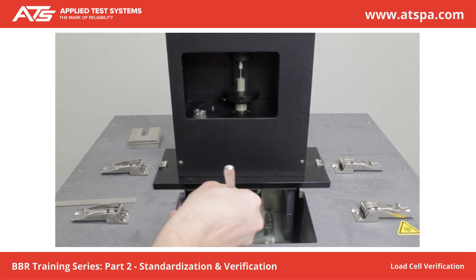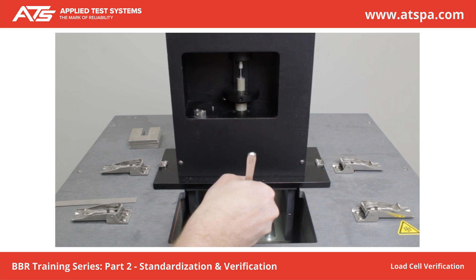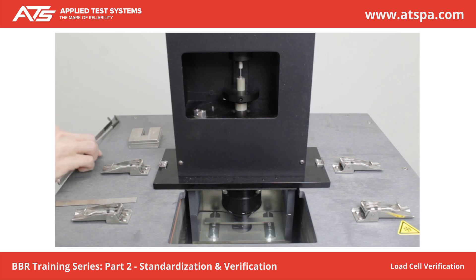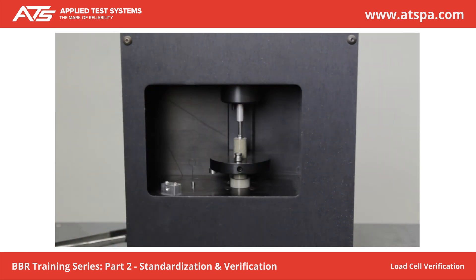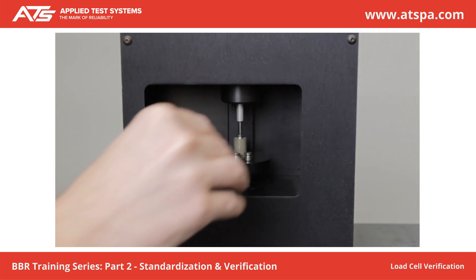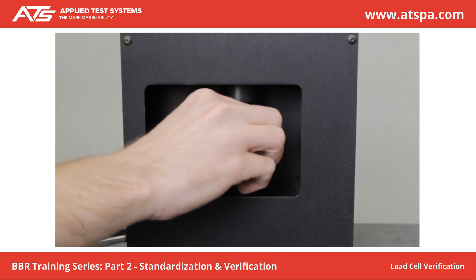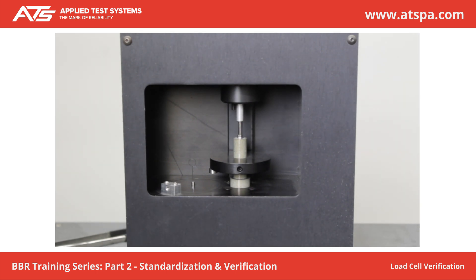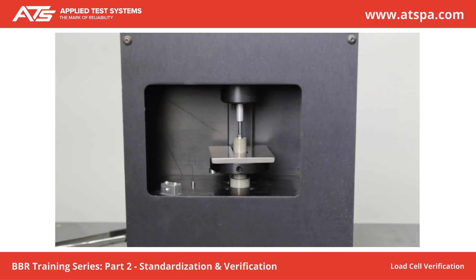Place the non-compliant beam on the sample supports. Adjust the zero regulator to lower the load shaft to the zero position. Press Tear. Apply a 20 plus or minus 10 mN load to the beam. Place a 2 g mass on the weight pan — the load indicator should increase by 20 plus or minus 5 mN. Place an additional 2 g mass on the weight pan; the load indicator should again increase by 20 plus or minus 5 mN. If the load indicator is not increasing, then standardization is required. Remove the 2 g masses. Place 100 g on the weight pan; the load should increase by 981 plus or minus 5 mN. Mark Verification Complete if observations are satisfactory. Press Next.